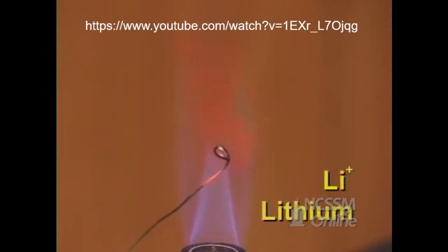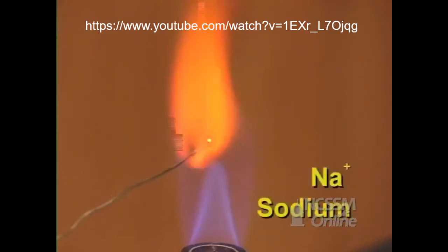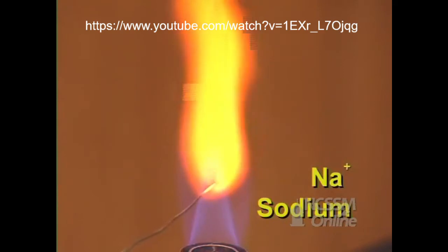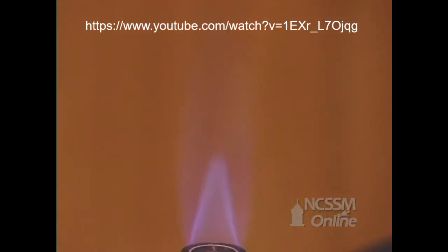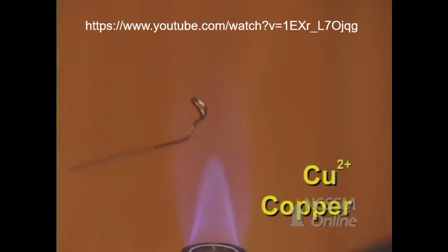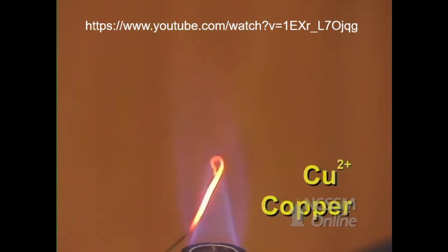Lithium. Sodium is a bright yellow. And then the last one is copper. And this is the most vivid of all of them. Nice green.